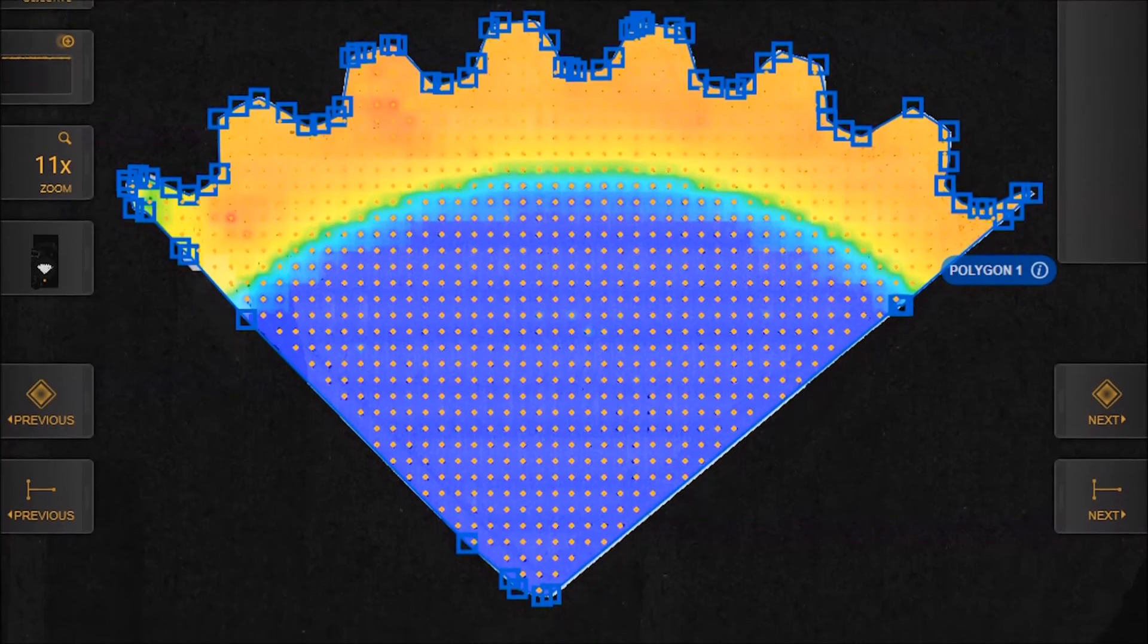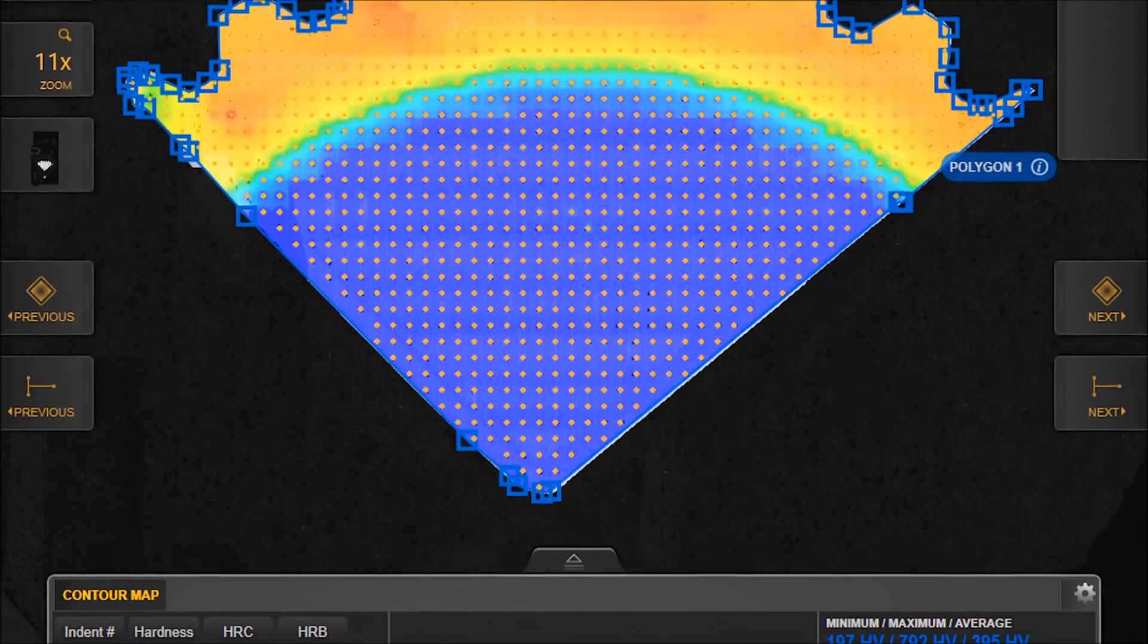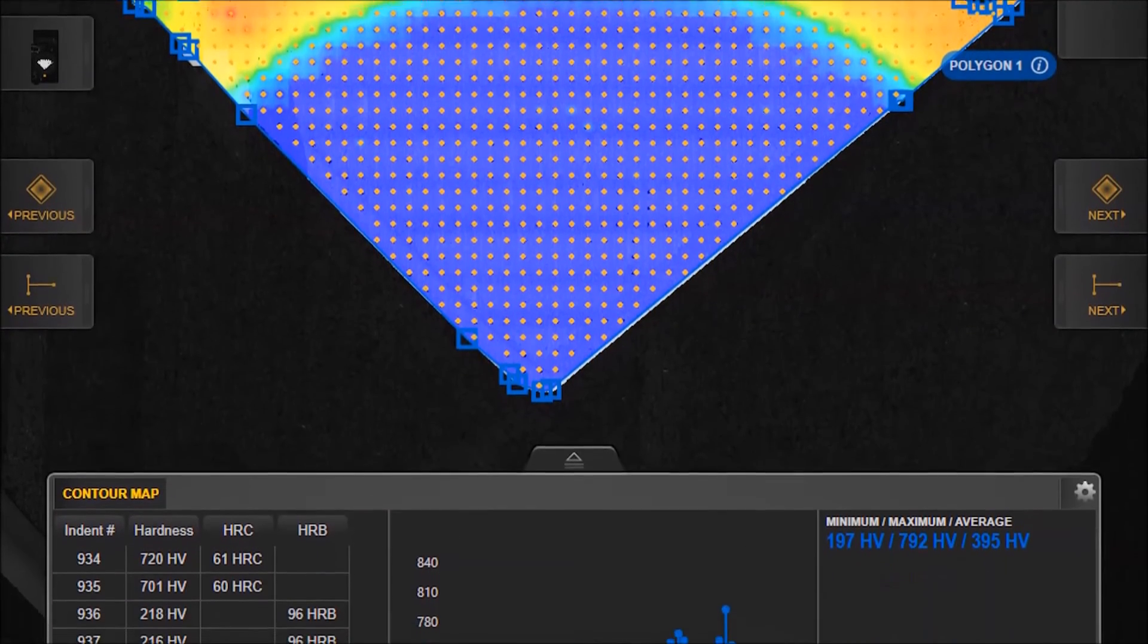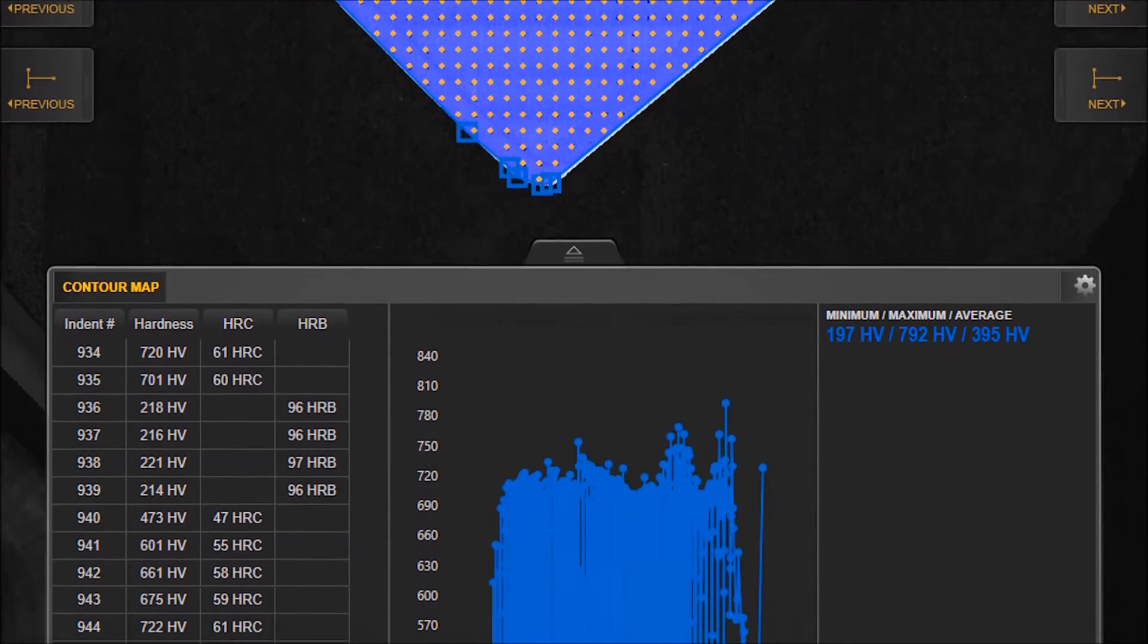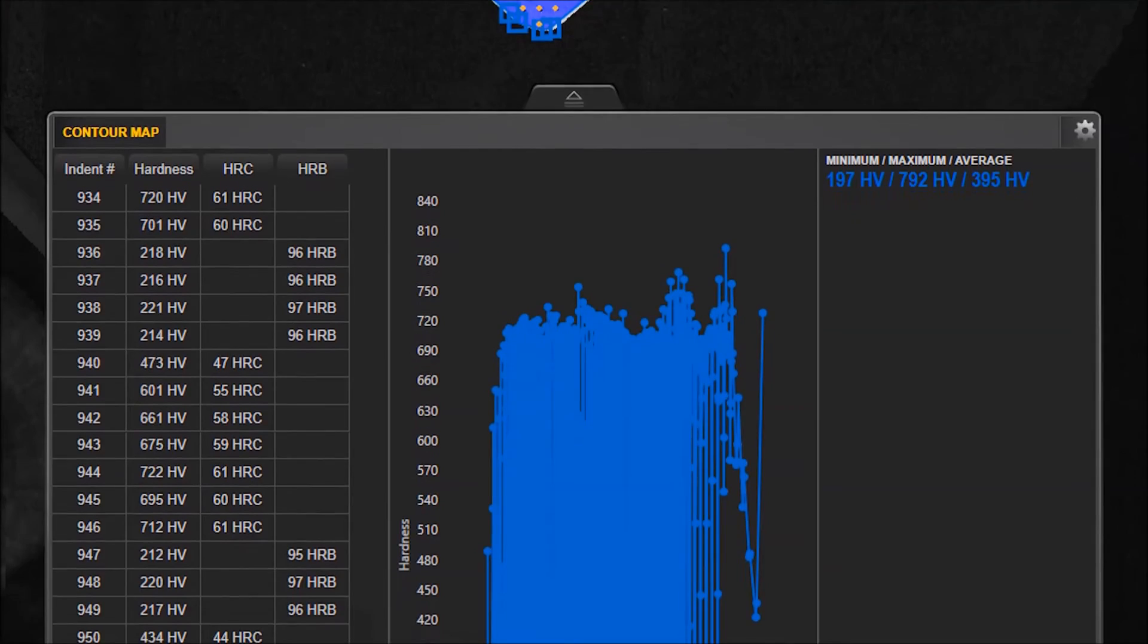The optional advanced analysis module takes your instrument automation a step further with the color hardness map, which displays the sample hardness and location with a color representation of hardness variances.